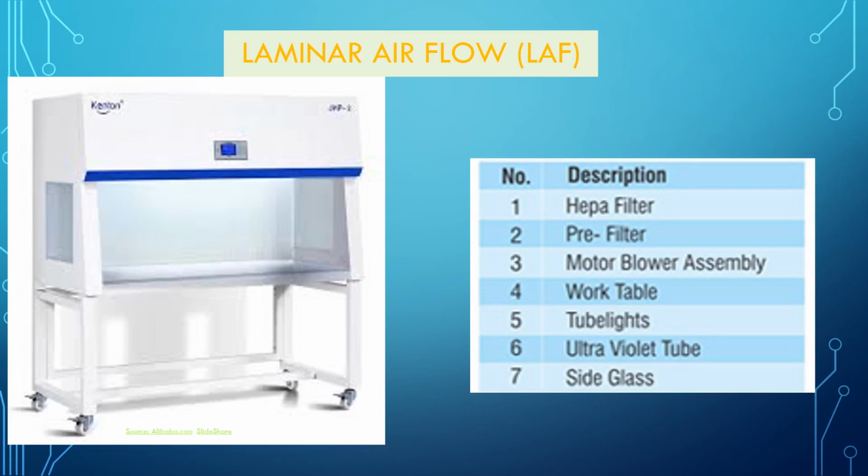Let us start with the laboratory requirements, among which the first is the laminar airflow bench. Since the plant cells and tissues are propagated in strictly controlled conditions, the process of plant tissue culture should only be operated under absolutely sterile conditions. For this, a laminar airflow bench is very necessary.